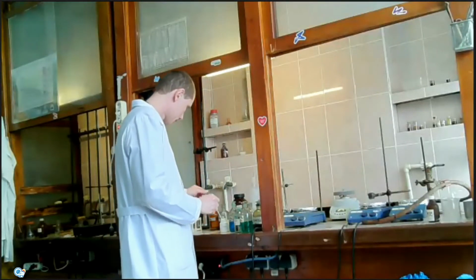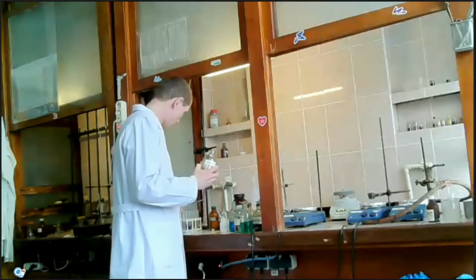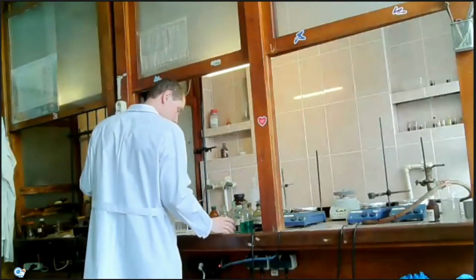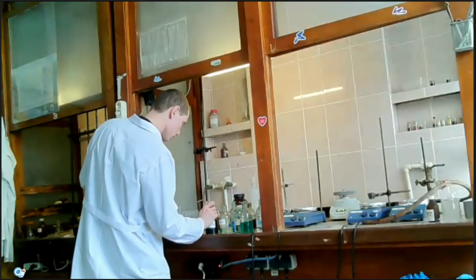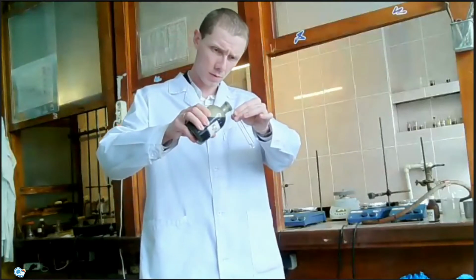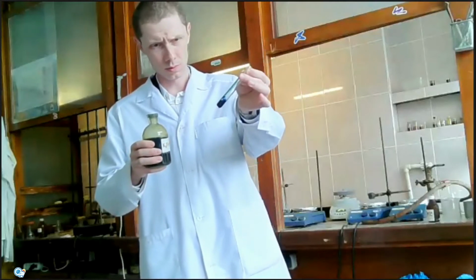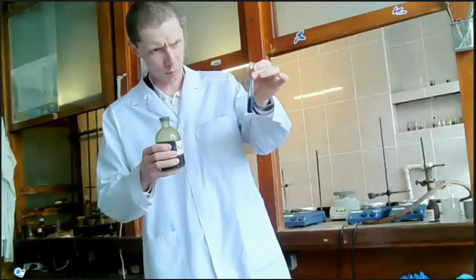Next experiment. If I take the iron sulfate solution and add potassium hexacyanoferrate solution, the dark blue solution and solid precipitate will be formed.